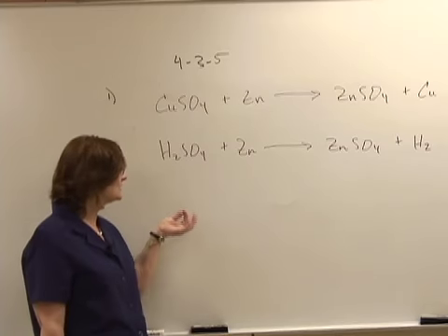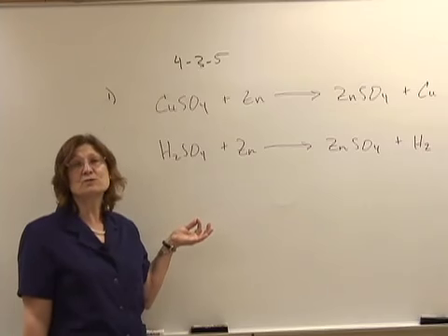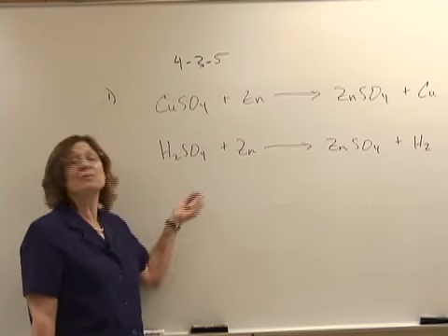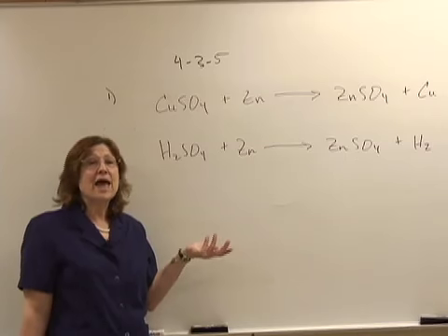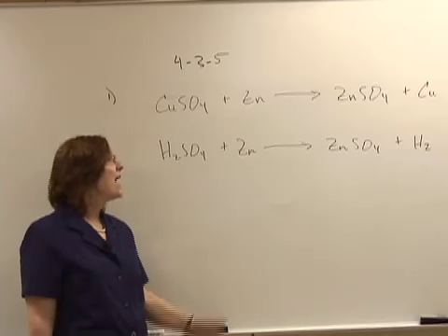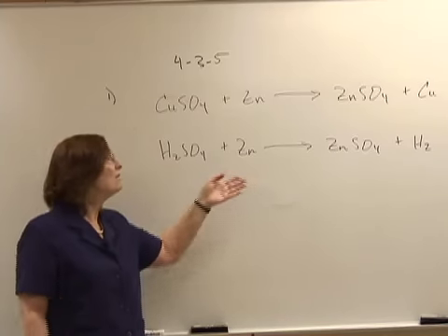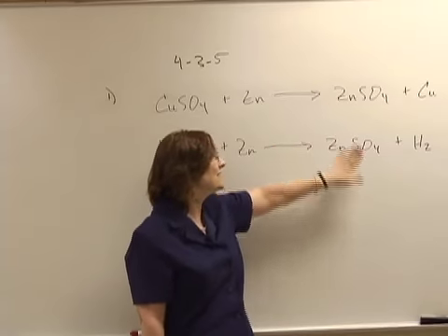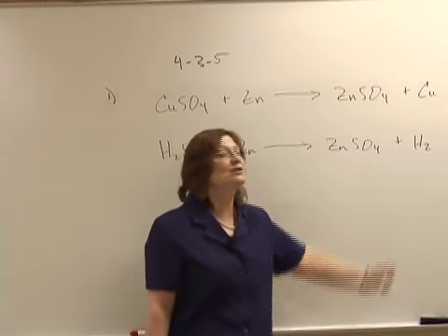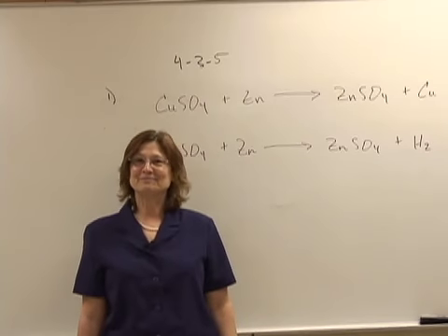We discussed that if we had 0.8 grams of the copper 2 oxide, which is probably close to what we had, it would only require 1.7 milliliters, and we added 15 milliliters, so it was clearly in excess. And that leftover sulfuric acid then reacted also with the zinc, forming the same product of zinc sulfate and the hydrogen gas. And so that's where it came from, and that's what it was.